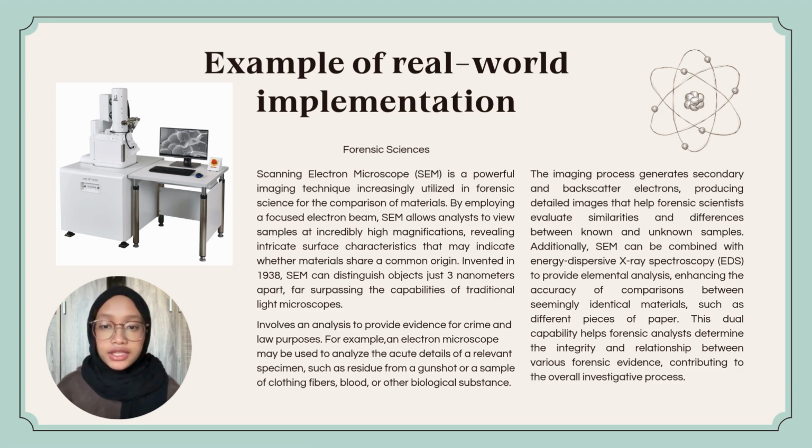Invented in 1938, SEM can distinguish objects just 3 nanometers apart, far surpassing the capabilities of the traditional light microscope. It involves an analysis to provide evidence for crime and law purposes.